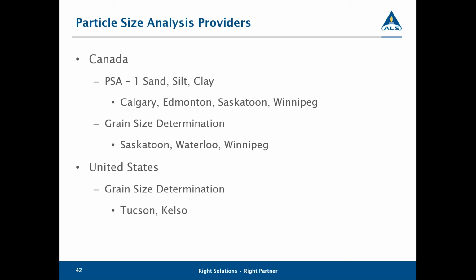In the United States, we do have our Tucson and Kelso labs that can do grain size determinations as well, following the ASTM 422 and their successor methods.